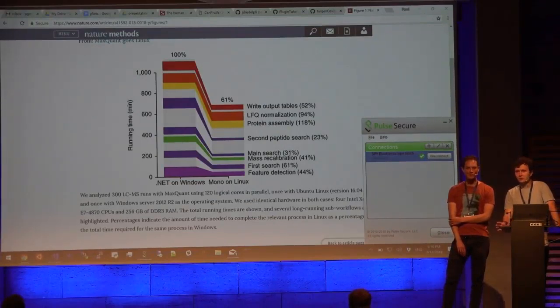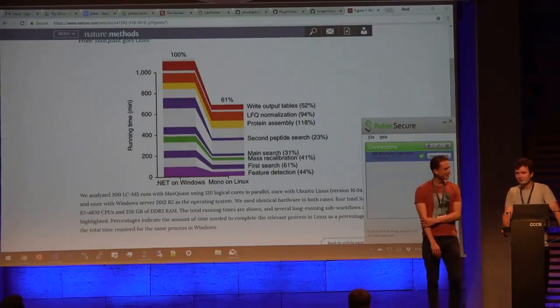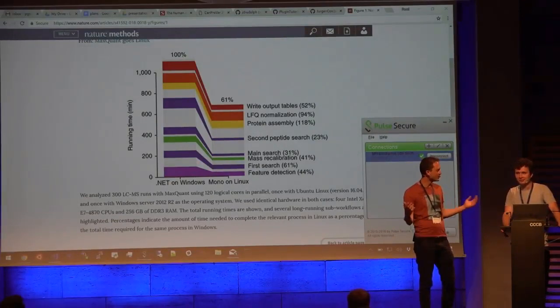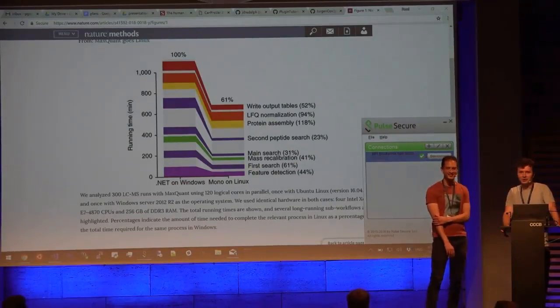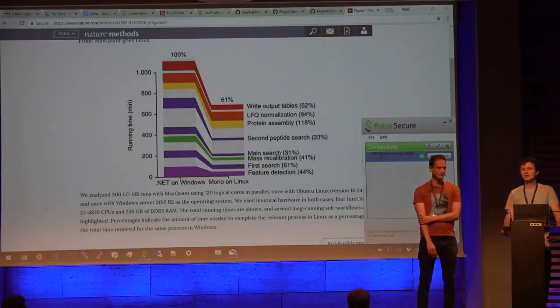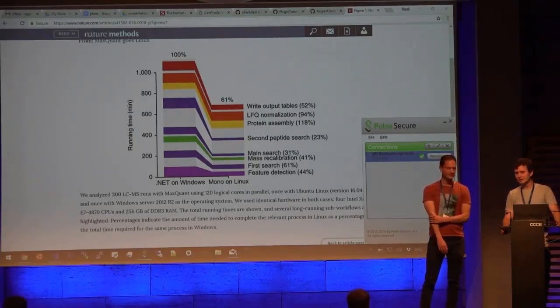But this limitation has many disadvantages. For example, if you don't have a Windows machine, you have your university cluster, and they don't want to deal with you, asking why it is not running on Linux. Second, these clusters are usually huge, and if you have pull-downs of 1,000 proteins, you don't want to make your computer suffer.